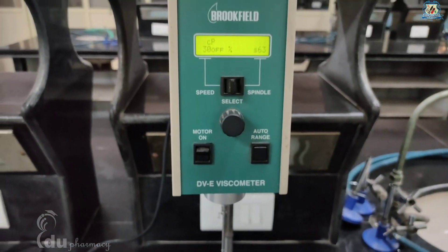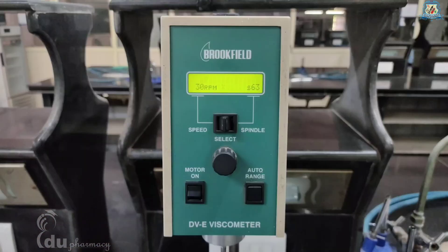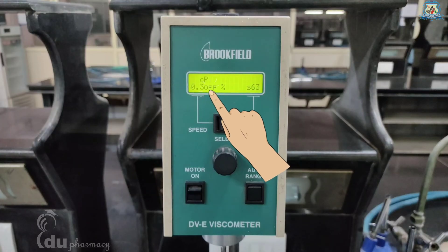A motor-on condition is indicated on the display by the RPM shown beside the speed. When the motor switch is in the off position, 'OFF' will be displayed beside the speed.